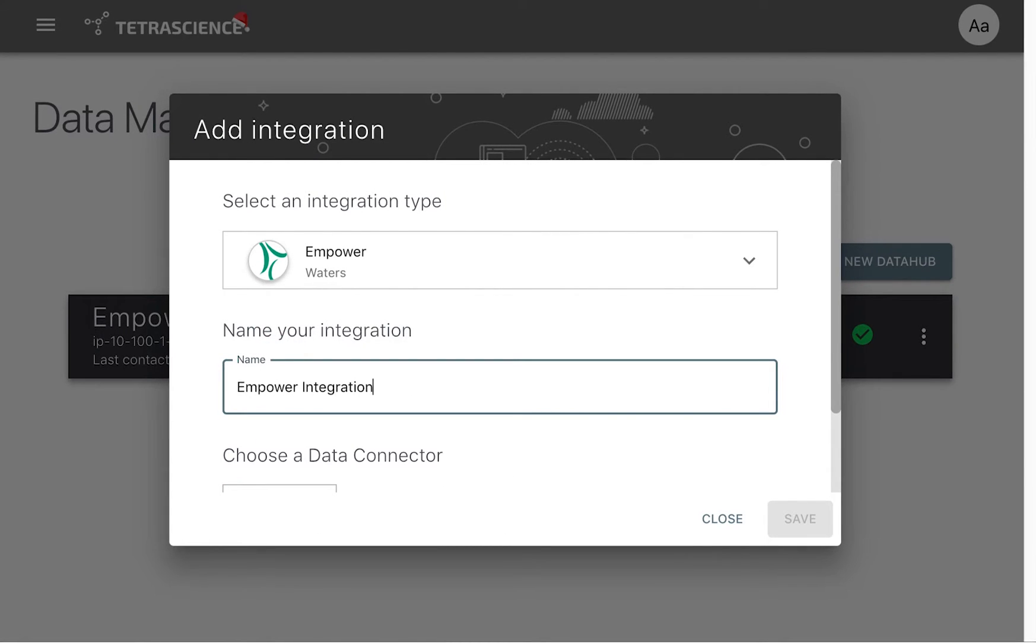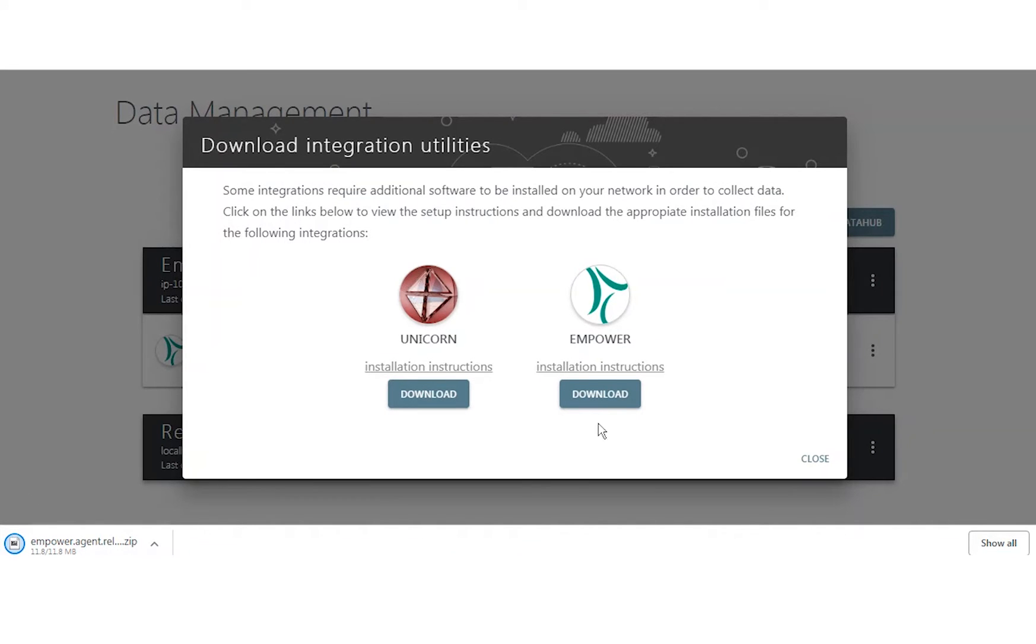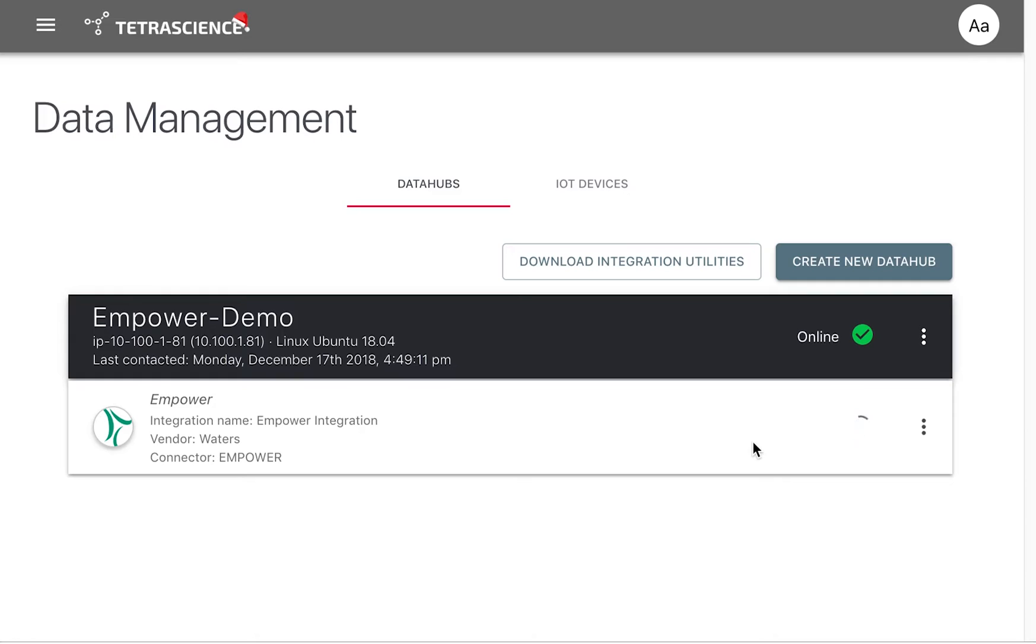We download the Empower agent utility. The agent is an executable that runs within an Empower instance. We will input the Empower account information and the Data Hub API, and our Empower agent is set up and working.